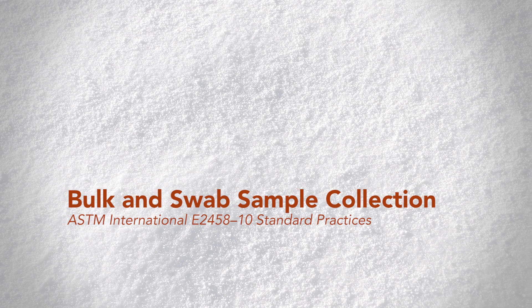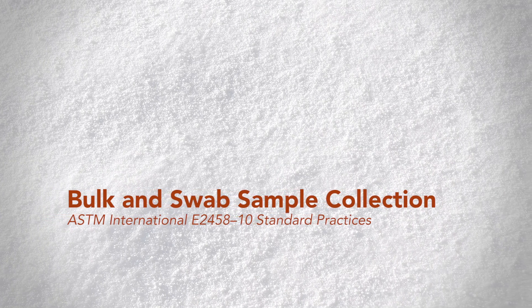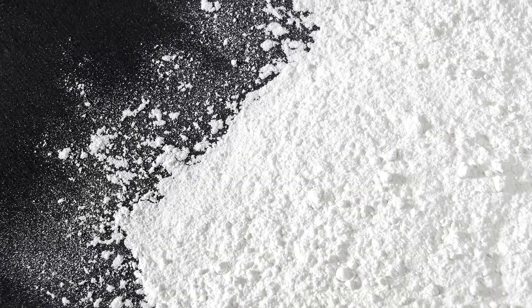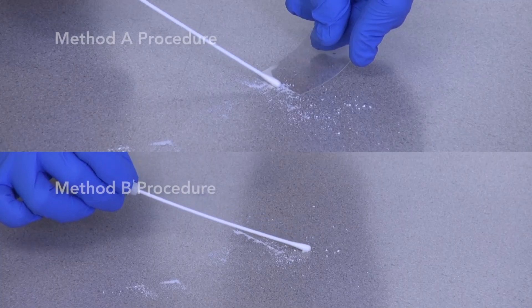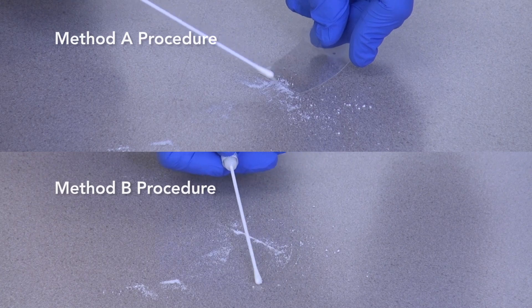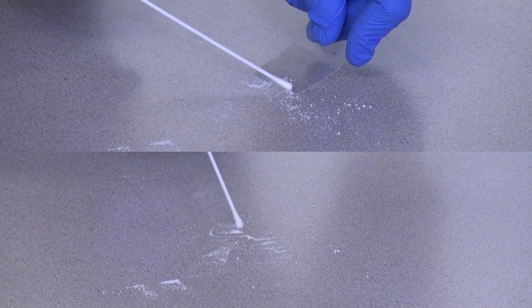The following is a demonstration of ASTM International E2458-10 Standard Practices for Bulk Sample Collection and Swab Sample Collection of visible powders suspected of being biothreat agents from non-porous surfaces. These practices address collection of visible powders that are suspected biothreat agents from solid non-porous surfaces by way of a bulk collection method using a dry swab and laminated card, followed by a swab sampling method using a sterile moistened swab. Bulk powder samples are collected and packaged in a manner that permits the maximum amount of the sample to be safely transported to a reference laboratory within the Centers for Disease Control and Prevention or CDC National Laboratory Response Network or LRN for confirmatory identification and safe storage.